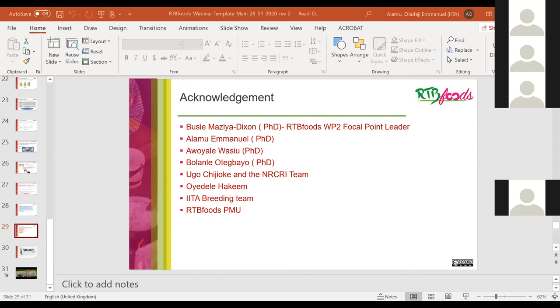Yeah, thank you very much for that. Good question. In this case, from the standard preparation of the gari itself, we have already standardized. We measure the moisture content even after roasting, when we press to the same level. So the gari has the same moisture level. We do not adjust anything at the gari level because we follow the standard preparation of gari. People adjust the water because the procedure of preparation of gari is not standardized. People can press to any level and then roast, and the dryness of the roasted gari depends on the individual.